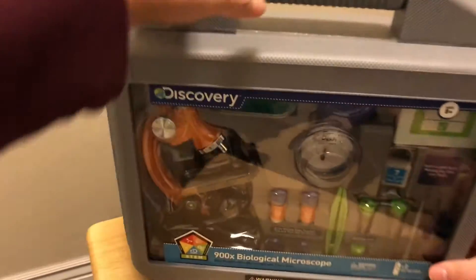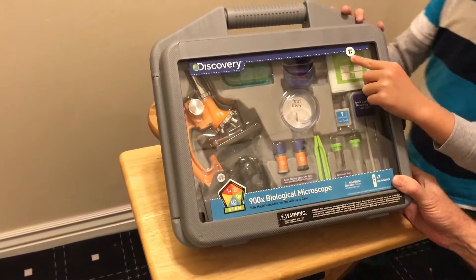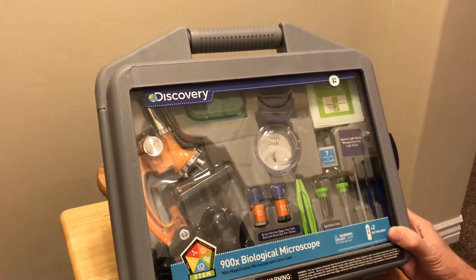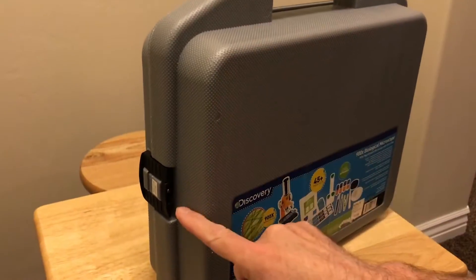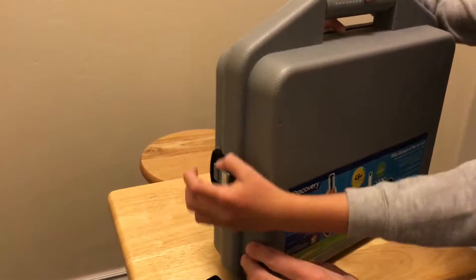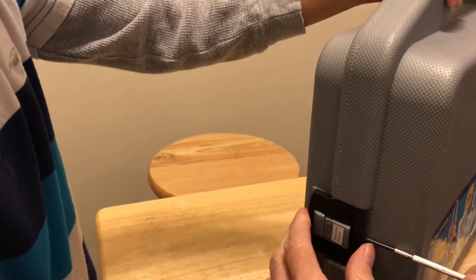You got the screwdriver? Yeah, that's a different toy. There it is. Age is eight plus — I'm definitely eight. Not yet, not yet. Okay let's open it. Where is the screw? You brought that out there and put it away. Here is the box — there's a screw in here to unlock this. One screw. Wow, it's like a safe. You cannot open it right away. There it is!